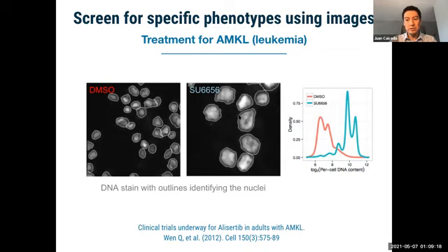So cell size was the specific feature that they were looking at here in order to determine whether compounds are doing a good job or they are useless, because sometimes in the drug discovery process, you cannot find the type of behavior or the type of effect that you would like to have. But in this case, they found this specific compound after screening several other candidates, and the way in which they measured the impact of the compounds was by looking at images and measuring the total amount of DNA, which is what we plot in this other graph on the right.